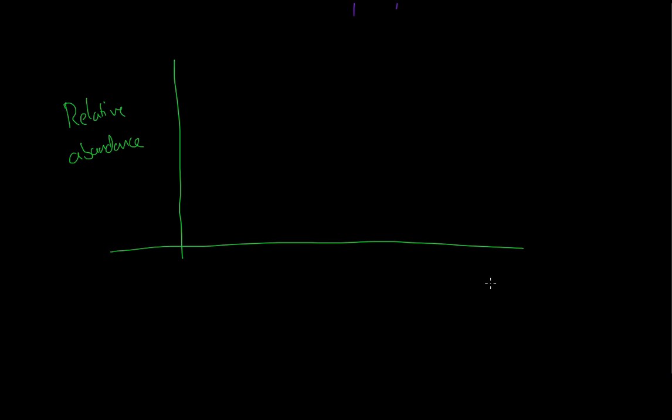And on the bottom we have a mass to charge ratio. This is called our m/z value. And this means that we can plot the mass of the ion relative to how much of an electric charge it produced. And that will give it the Mr, so the relative molecular weight of the compound.